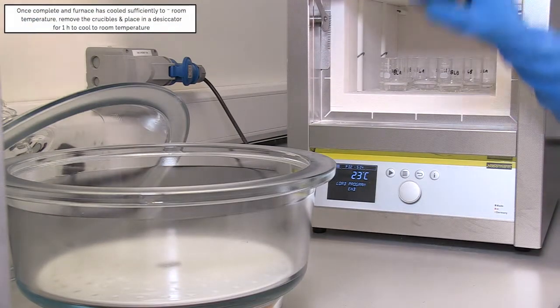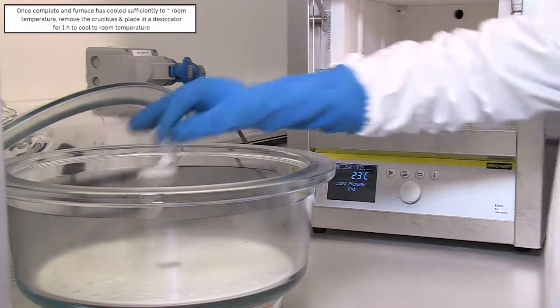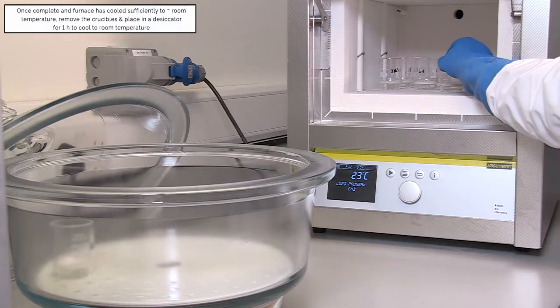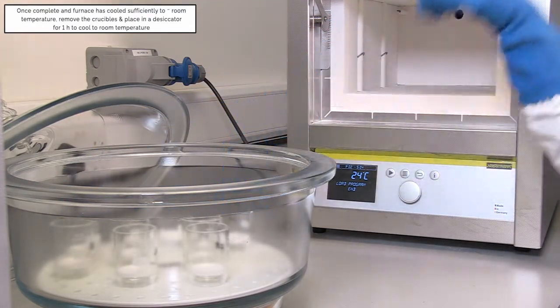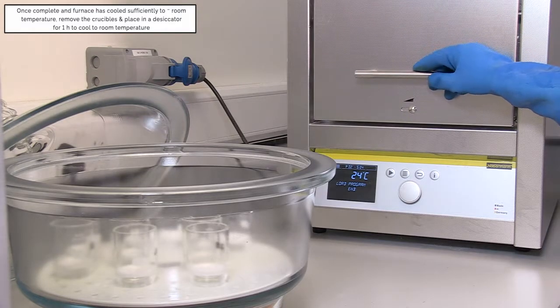Once this cycle is finished and temperature is approximately at room temperature, remove crucibles from the furnace and place warm crucibles in a desiccator for one hour to cool to room temperature.